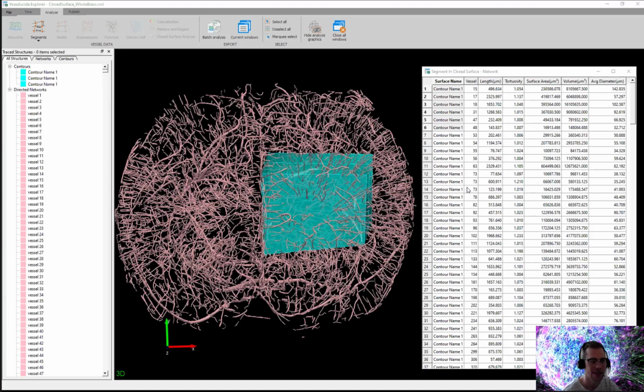I guess the one last thing I didn't get to cover here is our puncta detection and reporting. Maybe that's something that I can share a little bit later in a different webinar. I'd also be interested in showing the different filtering tools and different filters that we can apply if that's something that people are interested in.